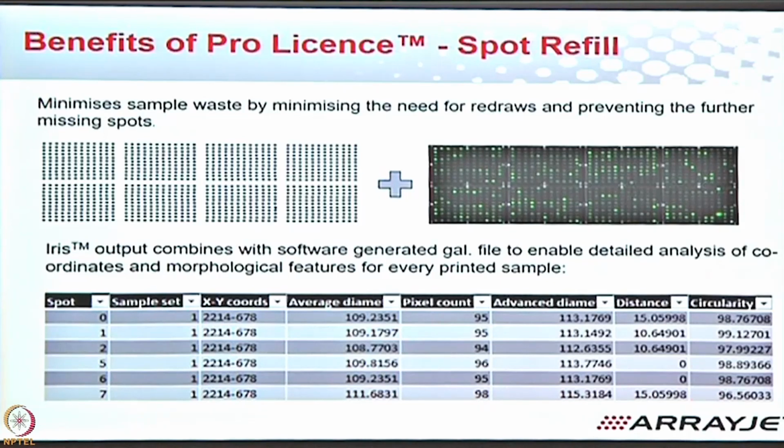So it gives you complete details to be able to verify or plot a standard curve or get a paired t-test, etc.